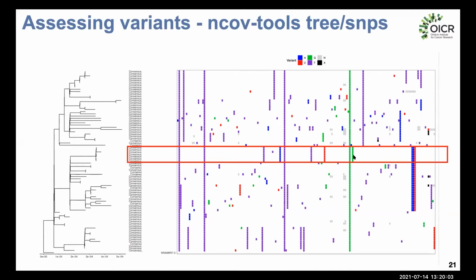So this plot just gives you a very quick overview of the variation that's present in your genome, and you can start to look to see whether the patterns of variation are consistent with the groupings that you expect in your samples.